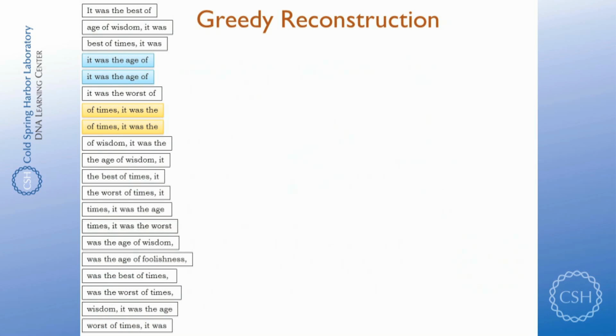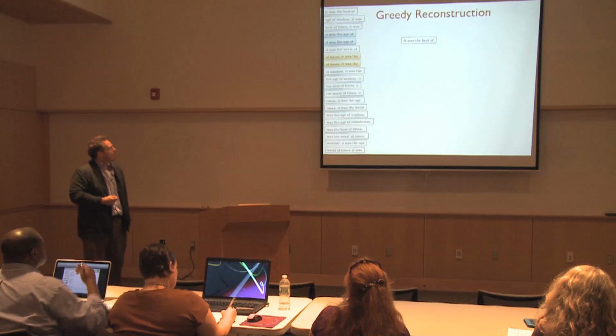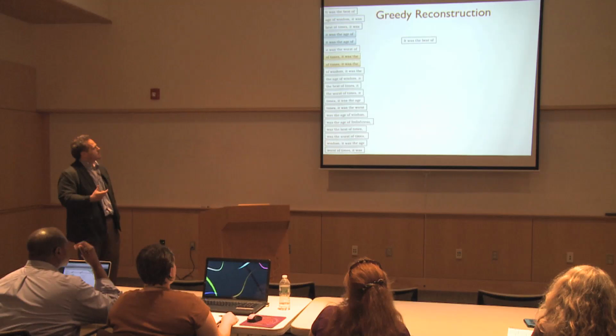And the whole business about genome assembly, or also de novo transcriptome assembly, is asking the question, well, which fragment comes next? If we can just figure out which comes next, and next, and next, we can take this big bag of shredded up fragments and hopefully piece it back together again into the entire genome. So just to give you some terminology, this is a fragment.